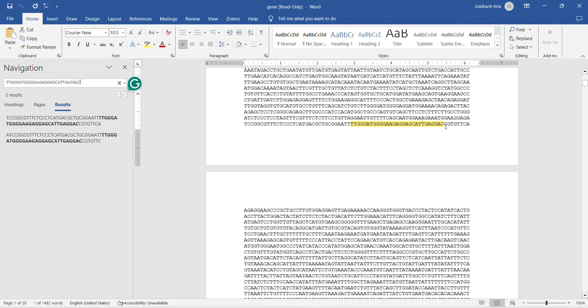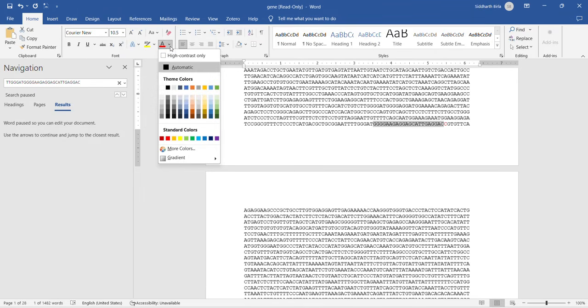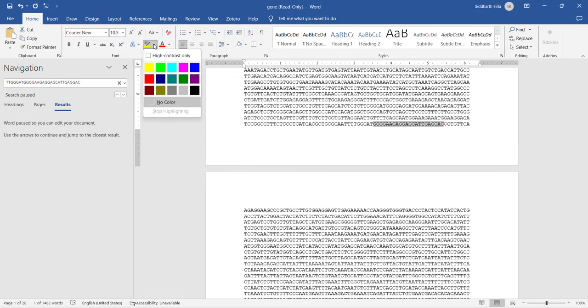Since you have seen, I had selected just before that red marked letter, so the next letter I'll select and mark it, of course, red, right? So this is our SNP present basically, and the remaining sequence that I just now searched and selected, I'll mark it with any other color, maybe not yellow. Actually, I'll highlight it with pink, right?